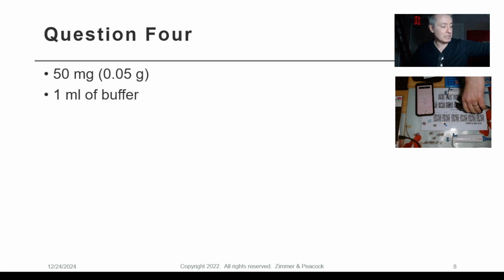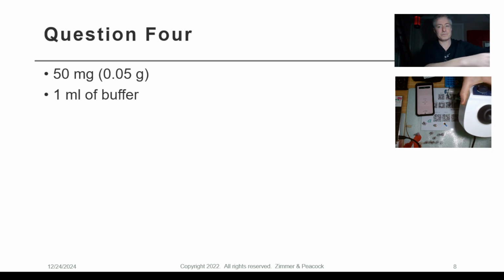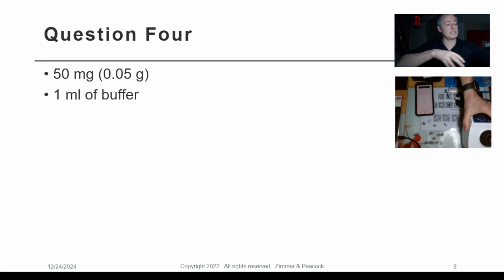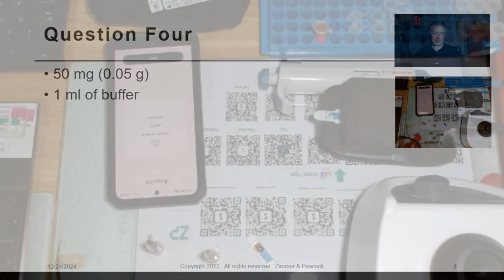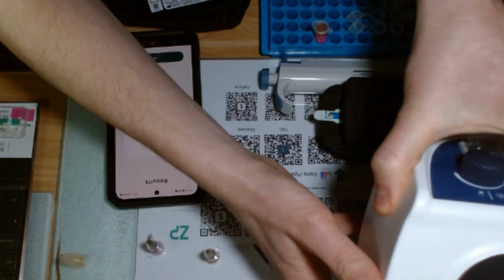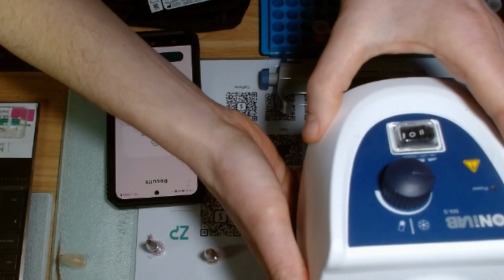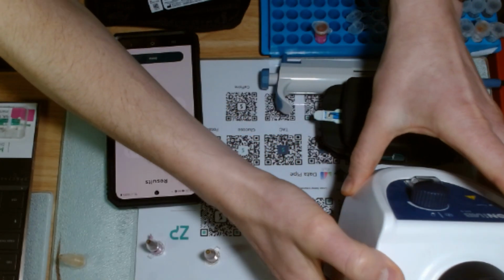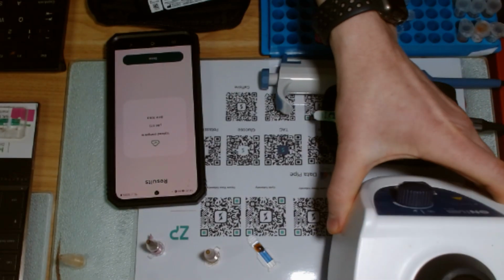And something that I use quite a lot when preparing these samples is a vortexer like this. In fact, I might just change the screen a little bit. Let me just go to external camera. This vortexer, you can buy these off Amazon. It's economical to buy them off Amazon, otherwise they're shipping all around the world and they're heavy enough, so it's better to buy them straight off Amazon.